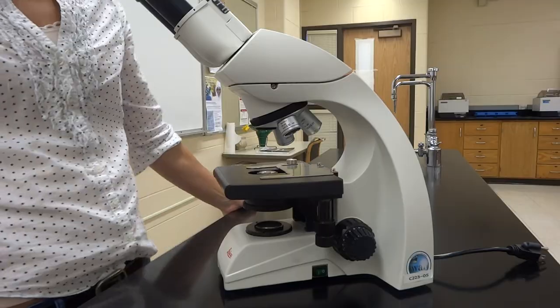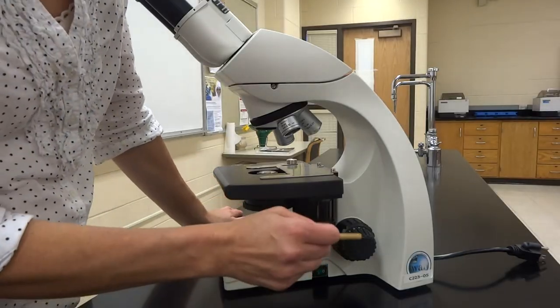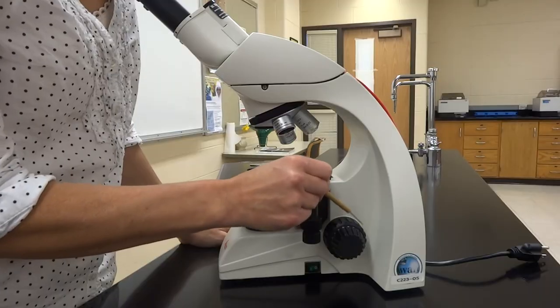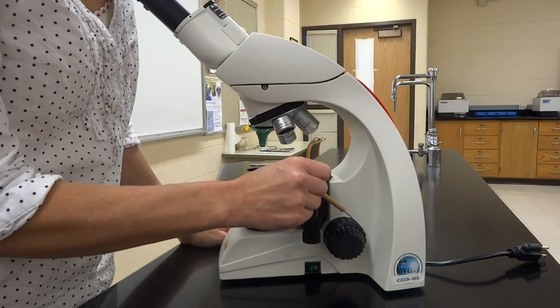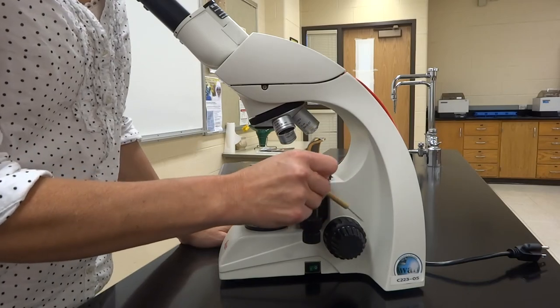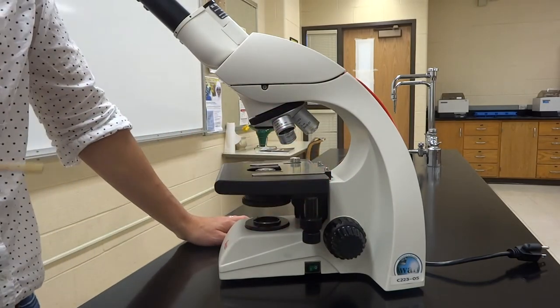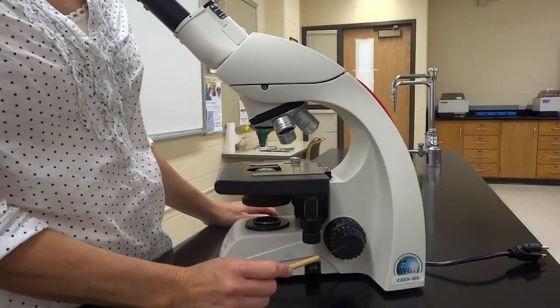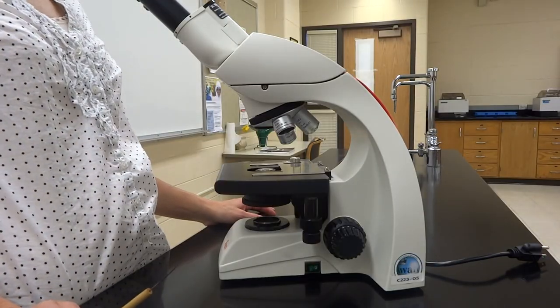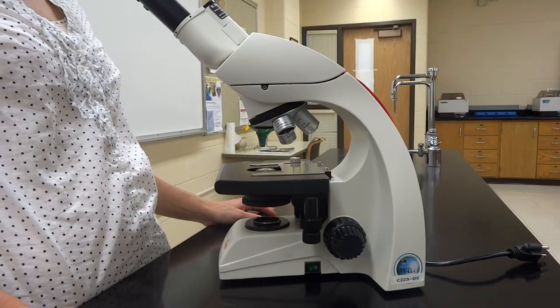Just above the on/off switch are two adjustment knobs: the coarse and fine adjustment knobs. Both move the stage up and down. The coarse adjustment moves the stage a lot, while the fine adjustment moves it just a little bit, so you can make that view picture perfect.